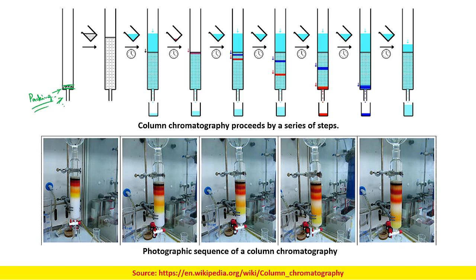What we are doing is basically making this pad. We are using this pad because when we pour the stationary phase, which is basically available as powder, the powder should not gain entry into this small channel. If it gets into the small channel, it will block the channel, and then you will not be able to work there.